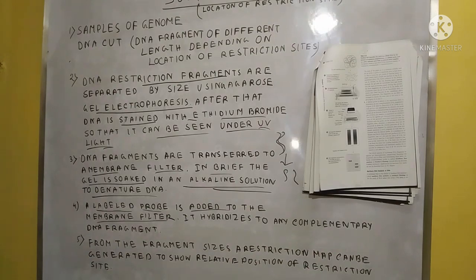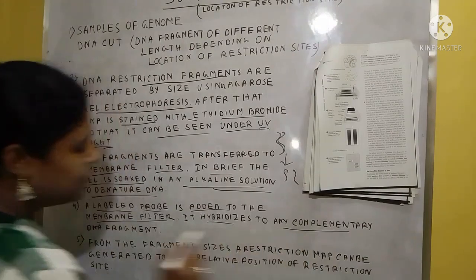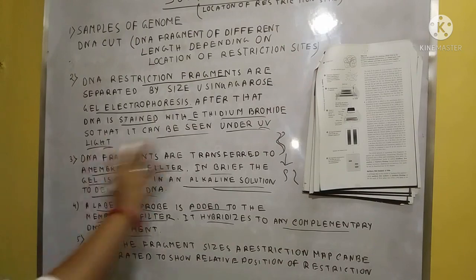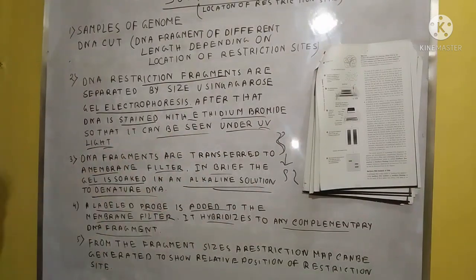When we transfer the labeled probe to the membrane filter, it hybridizes to any complementary DNA fragment. Many DNA fragments are there, and the one that is complementary to the labeled probe hybridizes with it. Clear? And the last one is the fragment.